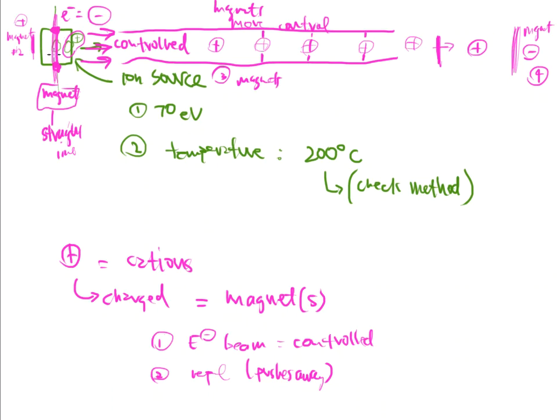First one controls electron beams. The second one pushes the positive species out of the electron chamber. The third one controls the positive pieces in what we are going to call the tunnel, but we're going to give that a proper name in just a second. And the fourth one is basically a lure. It basically gives the positive pieces a reason to travel down that tunnel and come out of the other end. So it promotes acceleration.